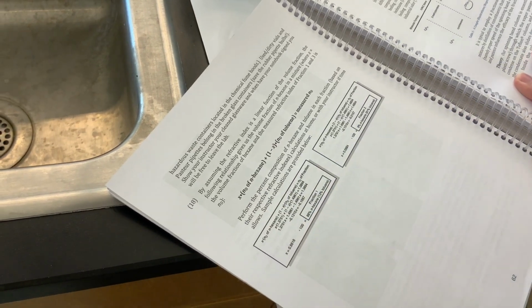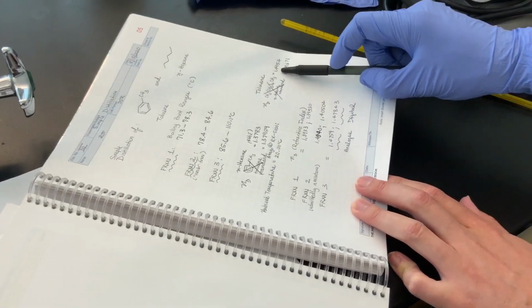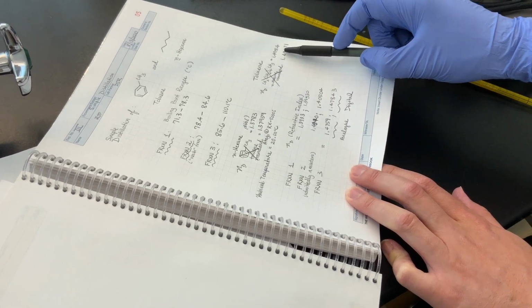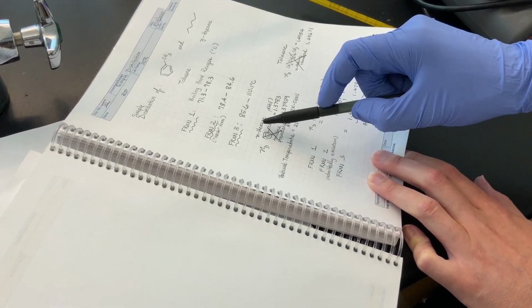So if we go ahead and look at our numbers, these were our standards. For toluene, it was 1.4954 for the analog, and 1.49671 for the digital refractometer.